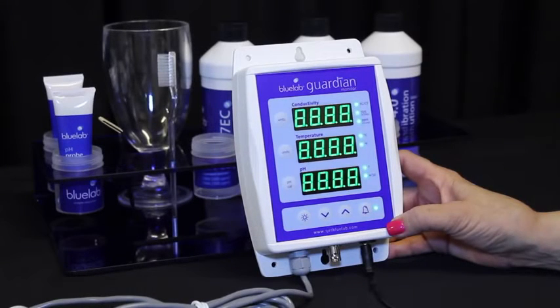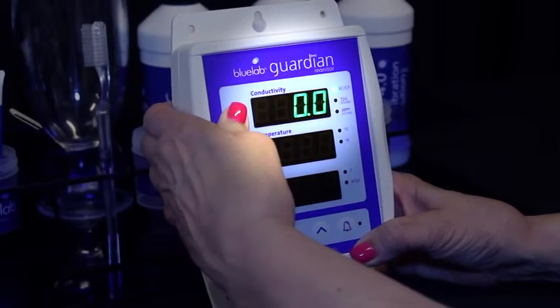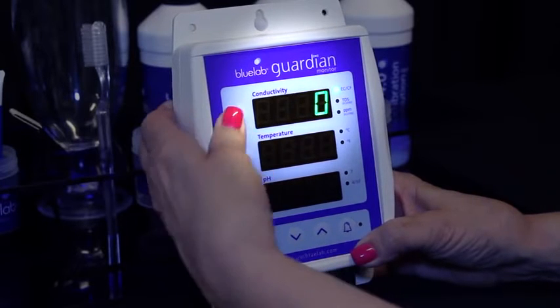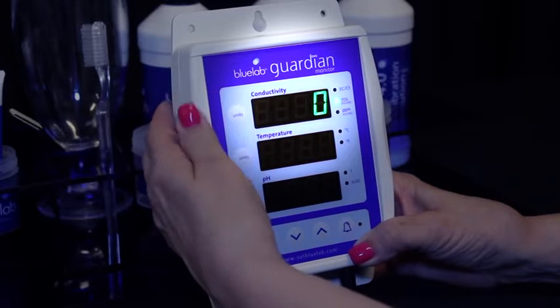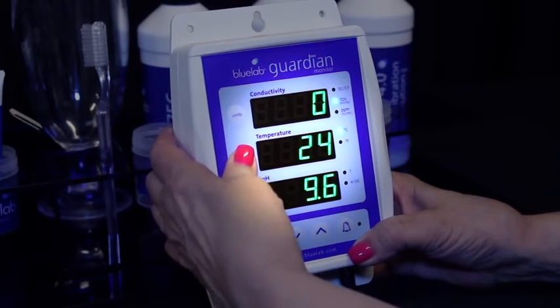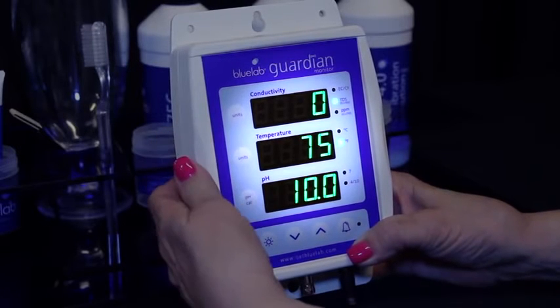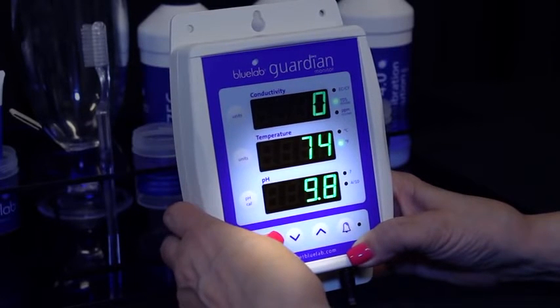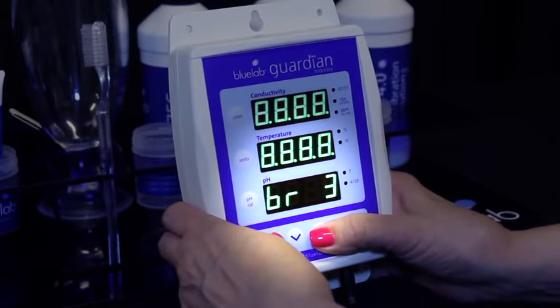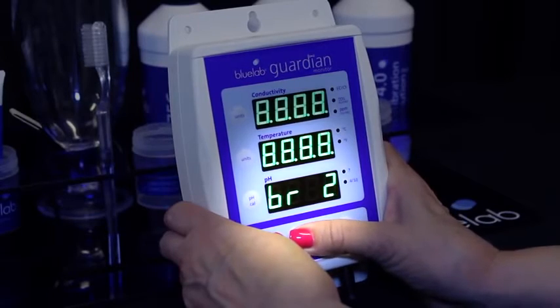Wait for the Guardian Monitor to complete the display test sequence. Press and hold the conductivity unit button for three seconds to change the units, then release. Repeat until the LED glows next to the units you want to measure in. Press and hold the temperature unit button for three seconds to change units, then release. Repeat until the LED glows next to the desired unit. Press and hold the brightness button and at the same time press the up or down button to change the brightness of the LEDs — one equals least bright, eight equals brightest.